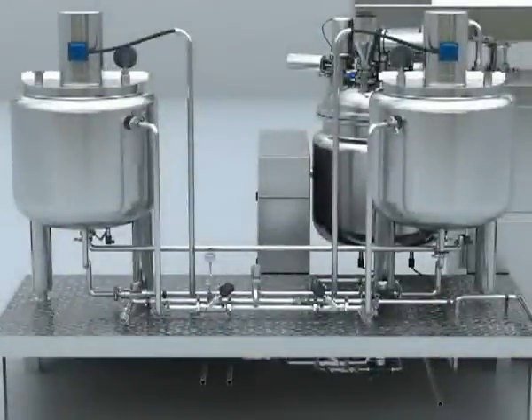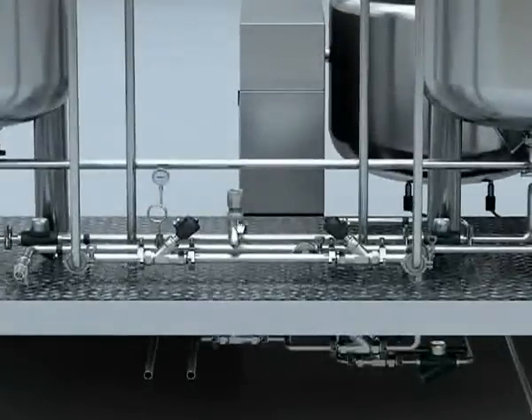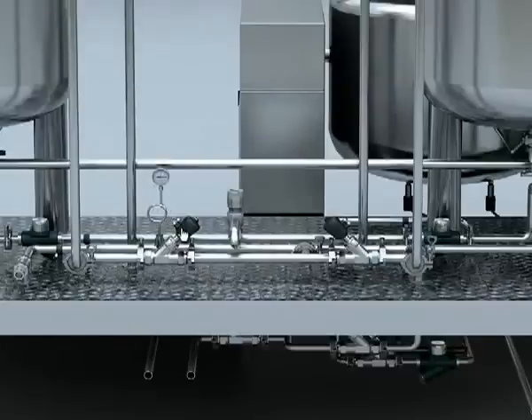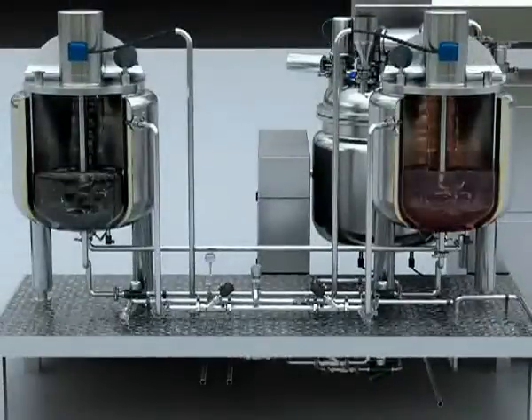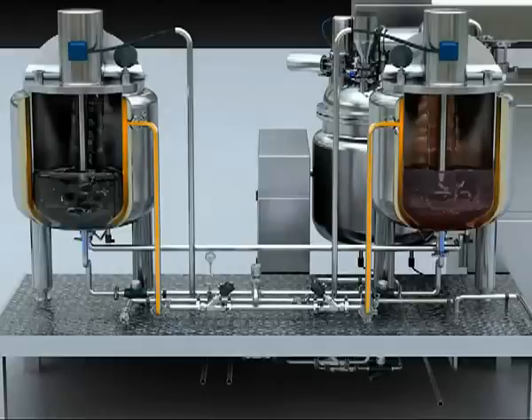6. Pipeline control system. It is made up of high pressure stainless steel tube, safety valve, manometer, fumatic valve and bleeder. When the steam and compressed air is normal, if the tank is heated, then the condensed water will be discharged from the bleeder after it goes through the pipeline, valve and the jackets of the tank.